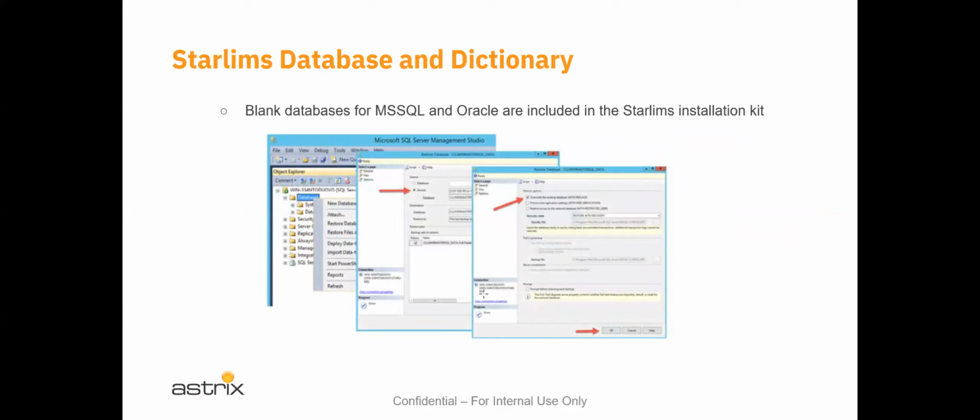So when installing STARLIMS, the installation package includes two blank databases for either Microsoft SQL or Oracle, and they contain the basic operating system and the basic dictionary for STARLIMS to present screens, to log into it. It won't have any tests defined in it because those are in the database, and we haven't defined any in a brand new installation.